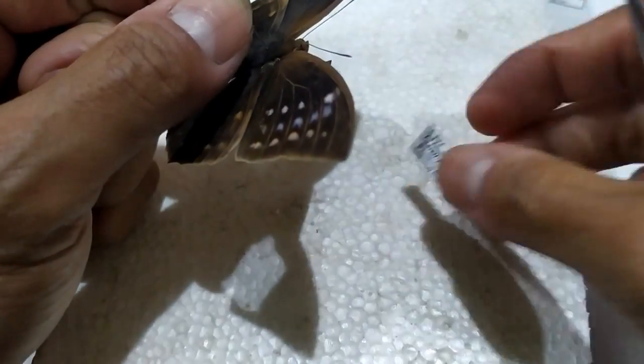If the specimen was pinned for educational or research purposes, prepare an appropriate label containing all necessary information pertaining to the specimen. Pin these labels below the specimen.